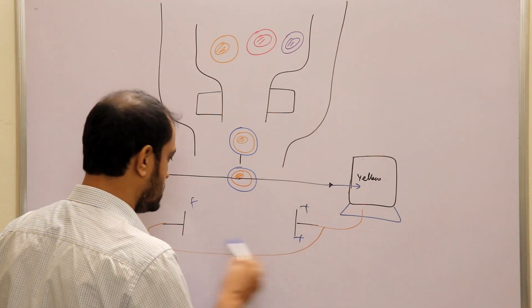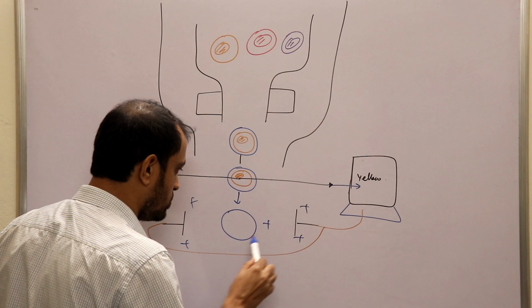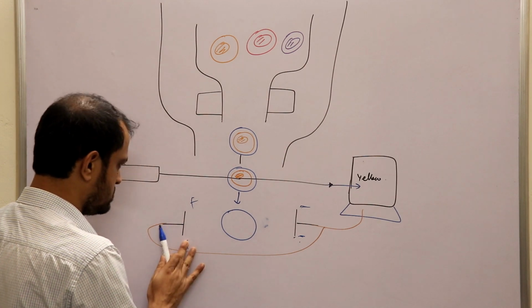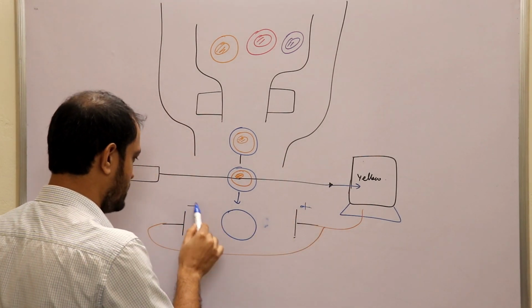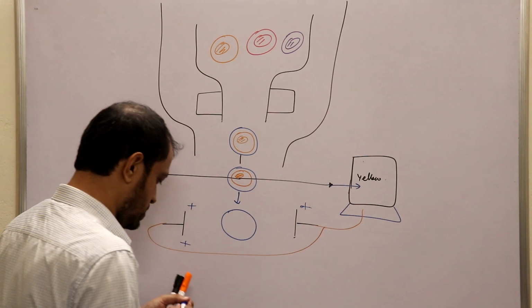They are now positively charged, and when this cell comes, this droplet as a whole acquires charge. This becomes negatively charged. This becomes positively charged. I'm confused at particular times when I am talking about this, because you will know just after 2 minutes.